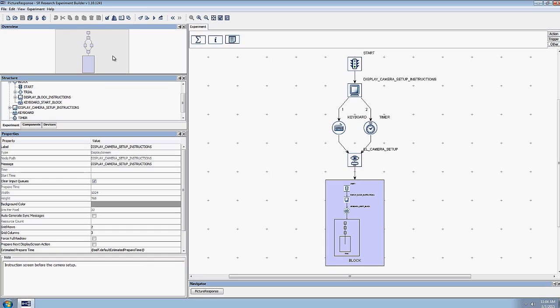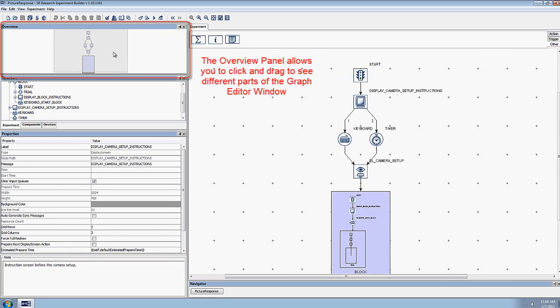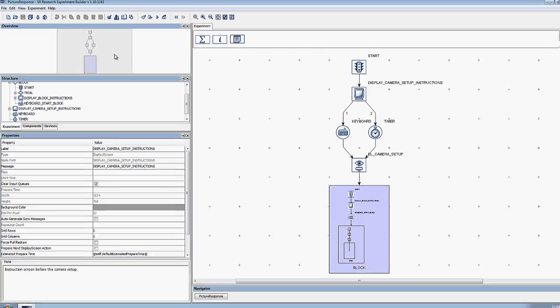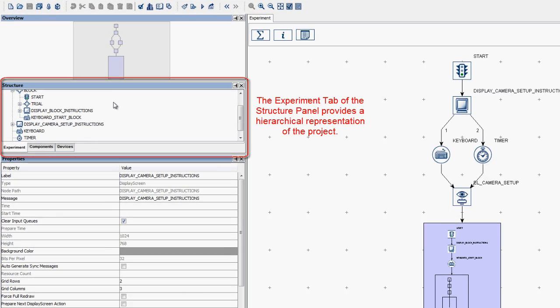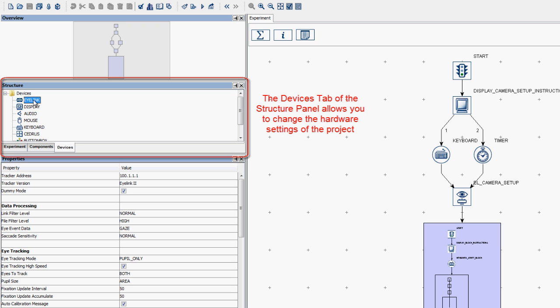On the left side of the interface there are several panels. The Overview panel allows you to quickly move around in the Graph Editor window. The Structure panel provides a hierarchical representation of the project that provides an alternative way to access the different components of the project. The Structure panel also contains a Devices tab. When you go to the Devices tab, you're presented with all the hardware settings of the project. To change the settings of a given piece of hardware, simply navigate to its subsection in the Devices section and edit the Properties below.